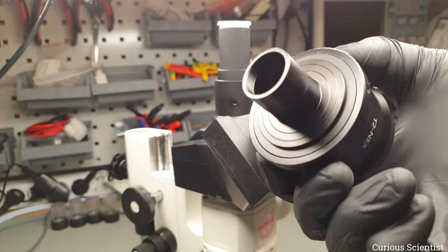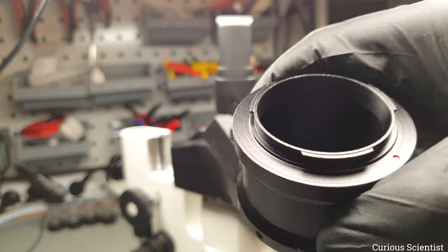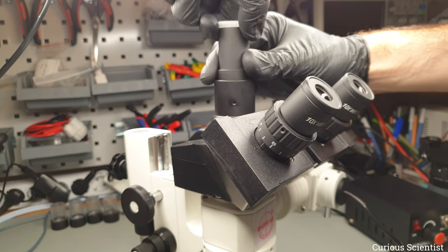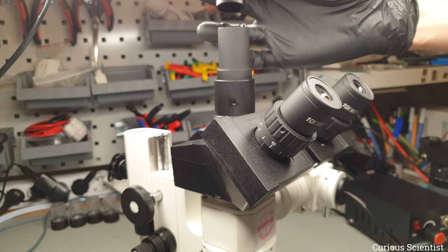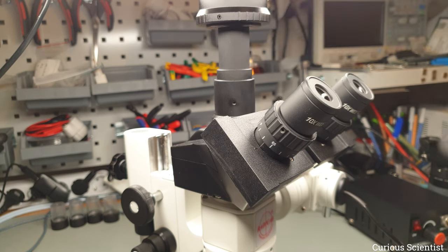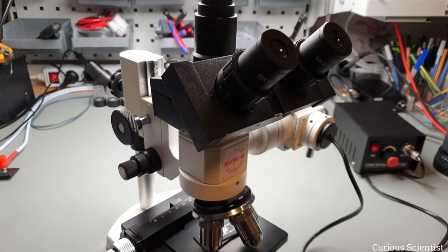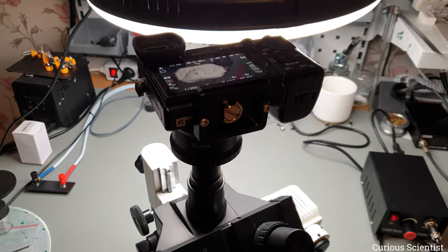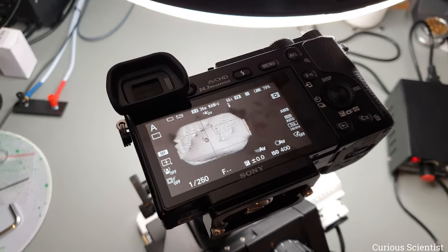I have a Sony E adapter to a 23.2mm diameter tube, which fits into the camera port of the trinocular head. The 23.2mm tube perfectly fits the port, and in the final assembly the camera sits on top of the microscope. Now let's look at some objects and see how the camera performs.